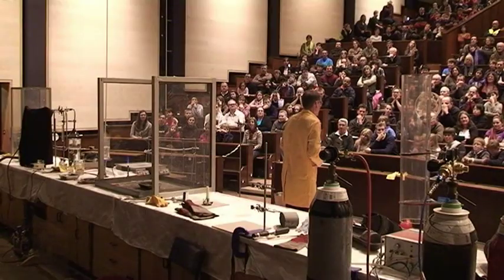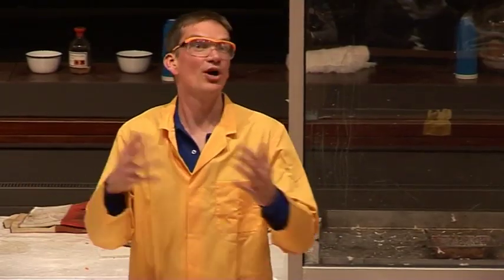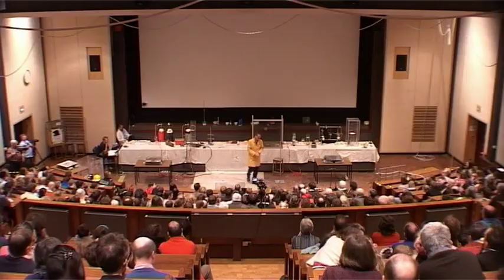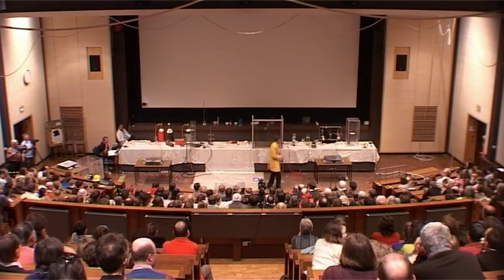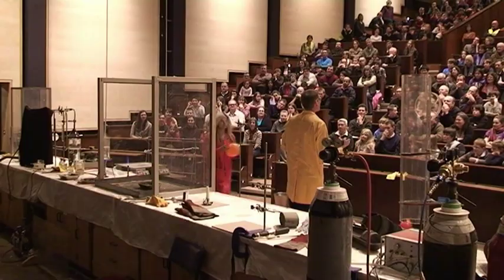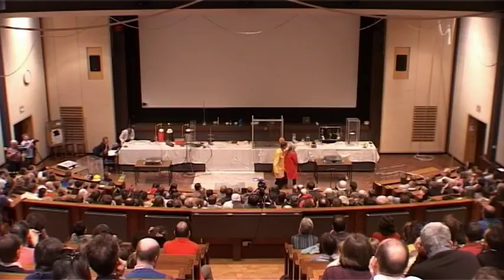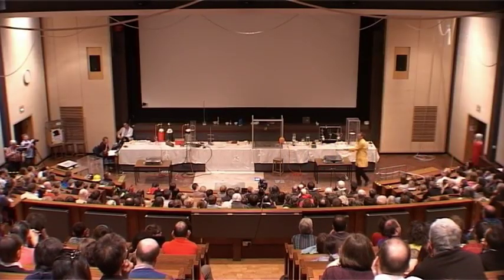Okay, right. So we've seen hydrogen burning in oxygen and oxygen burning in hydrogen, but they've been burning with a nice, quiet, gentle flame. What if we want to get a bit of a bang out of this? Well, we can do this. We need to mix up the hydrogen and the oxygen in just the right ratio. So Sarah here has filled up a balloon with hydrogen and oxygen gases all mixed together. And this particular balloon has equal amounts of hydrogen and oxygen. Right. So this one should go with a little bit of a bang now.